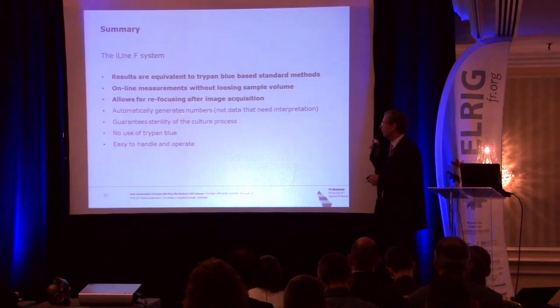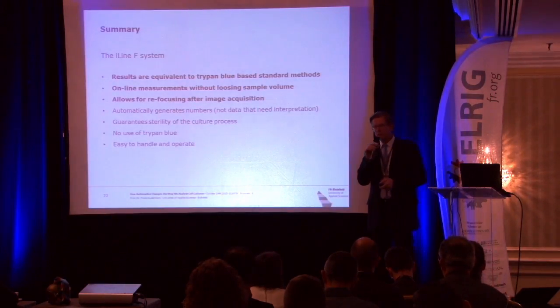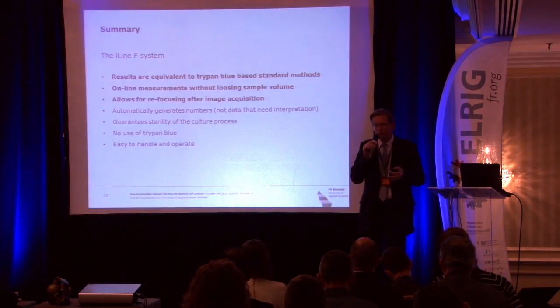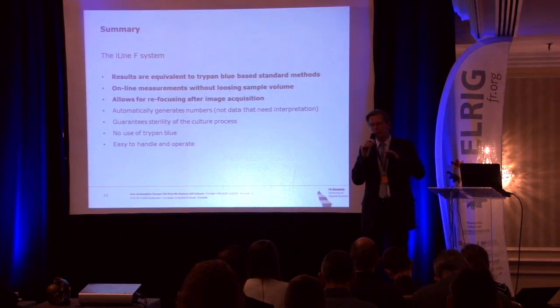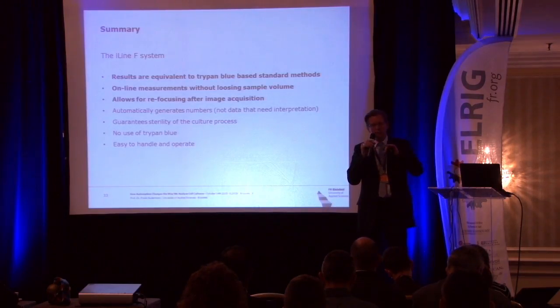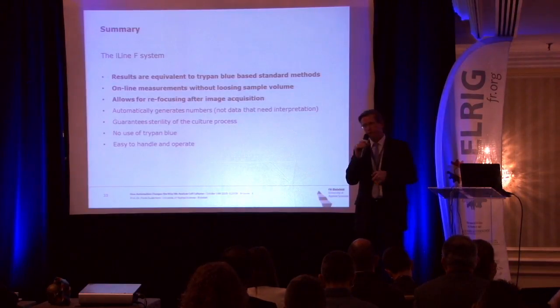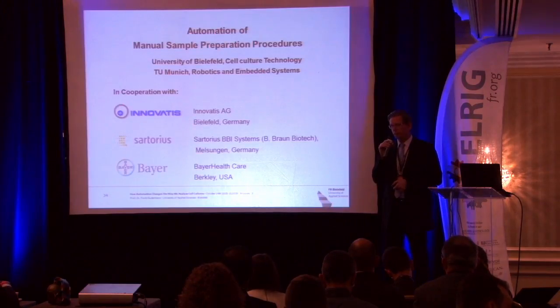image is taken. That's also something new I forgot to mention. With an image that is not sharp, you have no chance to get it in focus again. But while you get three-dimensional information and phase contrast about your cells, it is possible to refocus and go through different focus lines based on the information of the hologram when the sample is long gone. And that's something I guess also the FDA and EMEA will definitely like.